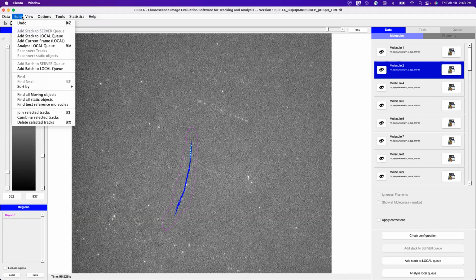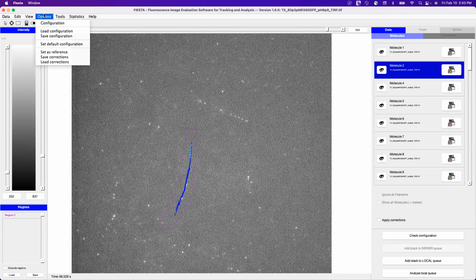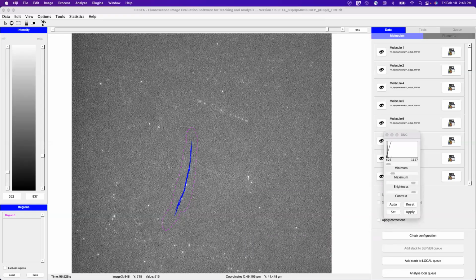See what else is there. I think that's mostly it. When do we need drift correction? I had a question for when we need to do drift correction. Drift correction is most of the time needed if you're just taking really long videos. Like here, let me get a cell 7 video. Got to bring cell 7 into this somehow.